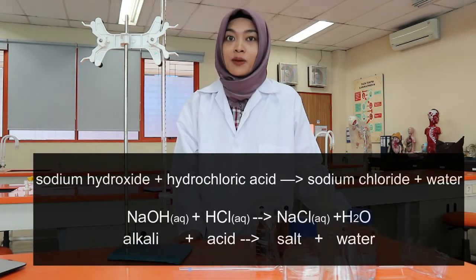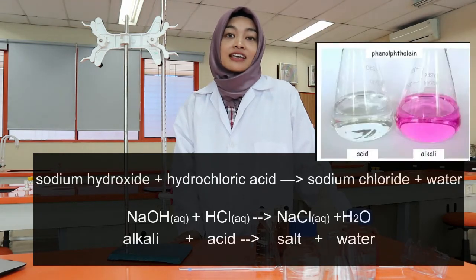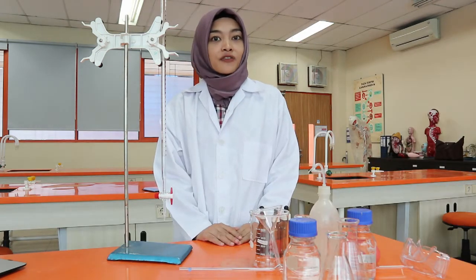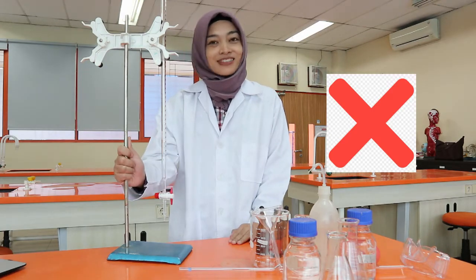Today, we will do a simple titration between sodium hydroxide and hydrochloric acid using a PP indicator. PP indicator is colorless in acid but turns pink in alkaline solution. At the end of this video, you will also help me determine which set of data results is accurate and which one is not. So, let's have fun!